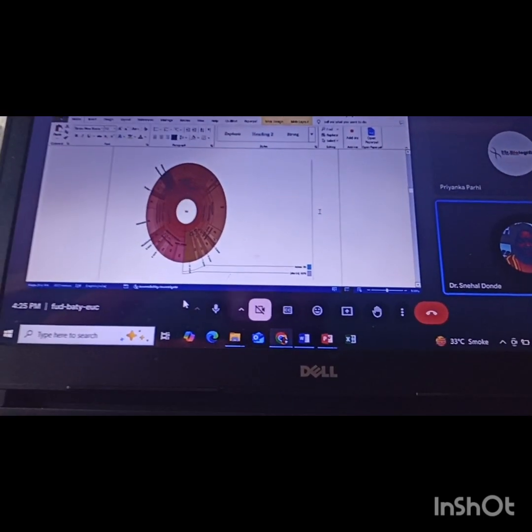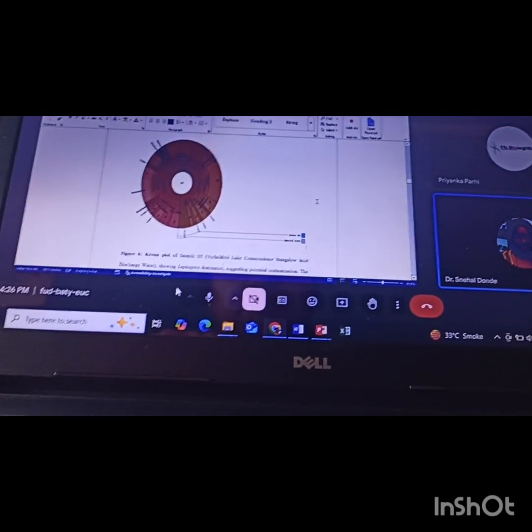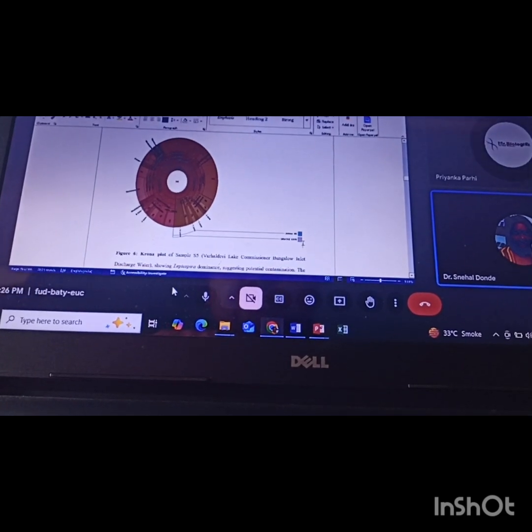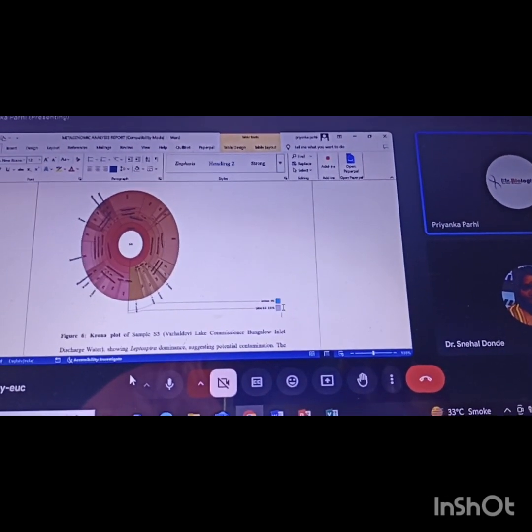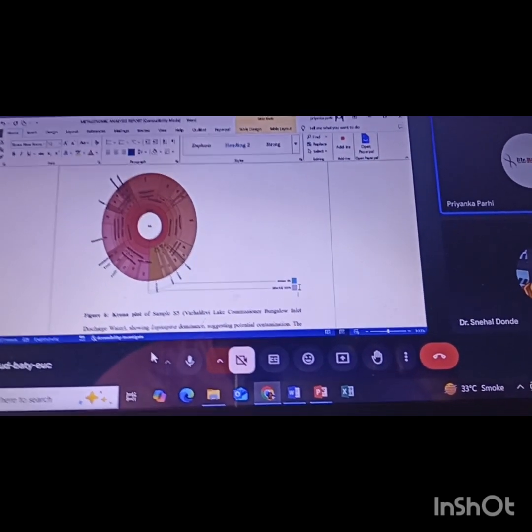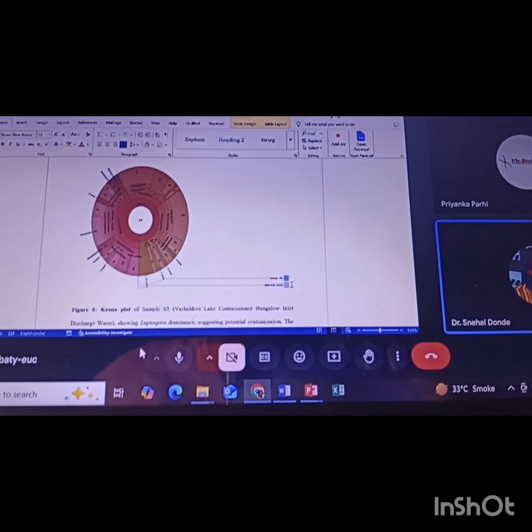Yeah, and in this you have marked blue and grey on the side, that is archaea, and I think what is that down one, bacteria? Other, which is not identified. Archaea is 0%. Okay. Other, S5, it might be fungi or it might be microalgae. Those are not identified in 16S. Okay, so it shows 0.01. So this is plotted with the help of 16S. Okay.